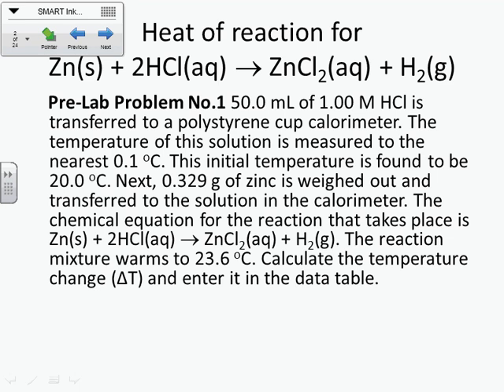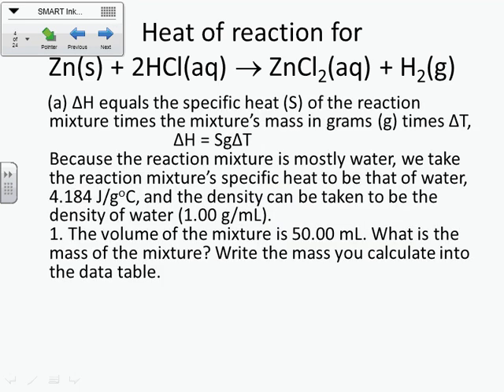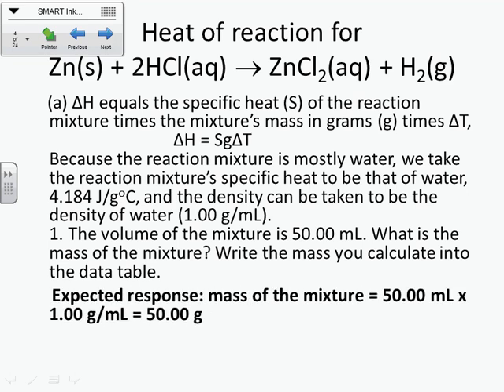See, here's where it gets a little tricky because we've got the HCl, right? But we did add zinc into it, right? So we actually kind of got into a little bit of a debate about this summer. I'm not entirely sure I'm okay with that because once we add the zinc into the mixture, we have changed the mass of the mixture.